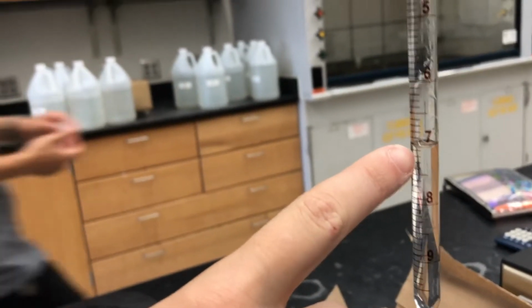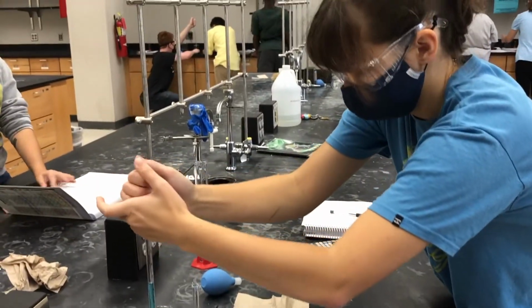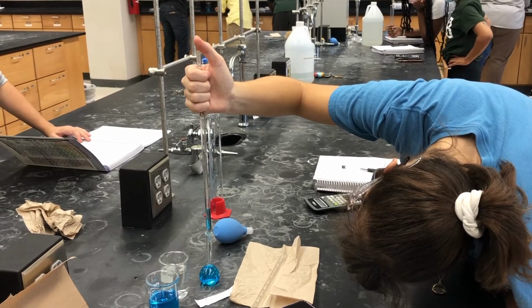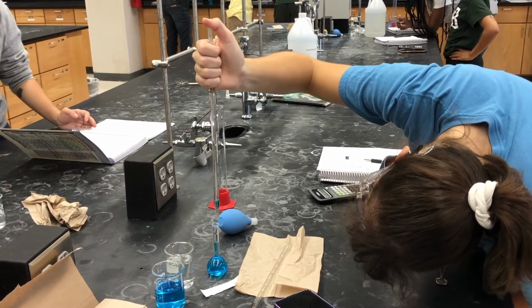This curve on the top of the liquid surface is a meniscus. This occurs because the adhesive forces attracting the water to the glass are stronger than the cohesive forces binding the water to itself. This causes the water to rise higher at the sides of the pipette. When reading the volume, you read from the bottom of the meniscus.